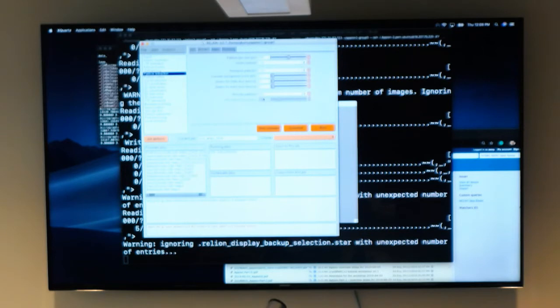So there's certain efficiencies that you can take to handle that. The reason being is that you may not have unlimited computation. So yes, Amazon is on demand and you can scale. You might have a cluster. However, you might collect a data set that, okay, let's say you're working on a very large virus with something bound to it, and you need a 1,000 pixel box size, and you have 100 million particles. Most people would run out of computation really fast if you collected in super res and worked with everything unbinned. You'll just tax out all the computation. Even if you get more computation, you still run out of it.